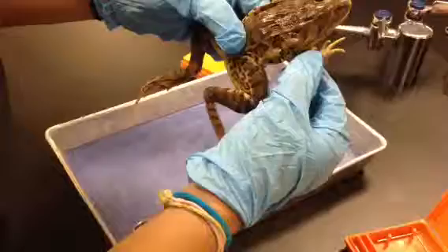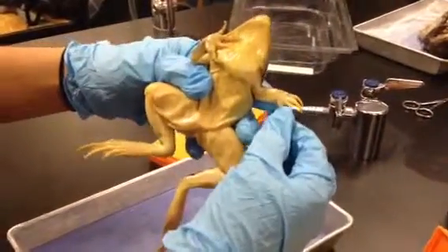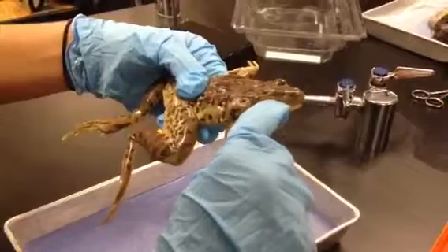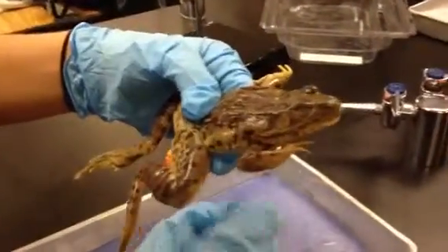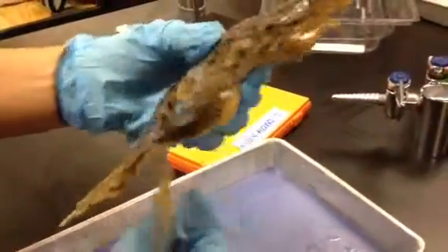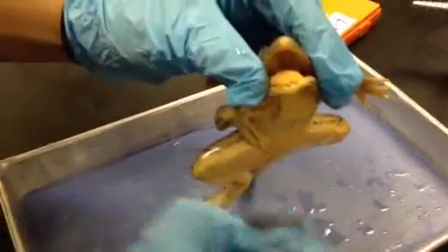We have the foreleg, the hind leg, the thumb, and this frog is a female. The webbed feet, the external nares, the eyeballs, the nictitating membrane, which is inside the eyeball. The mouth is here, the cloaca is down here, and the tongue inside the frog is right here.